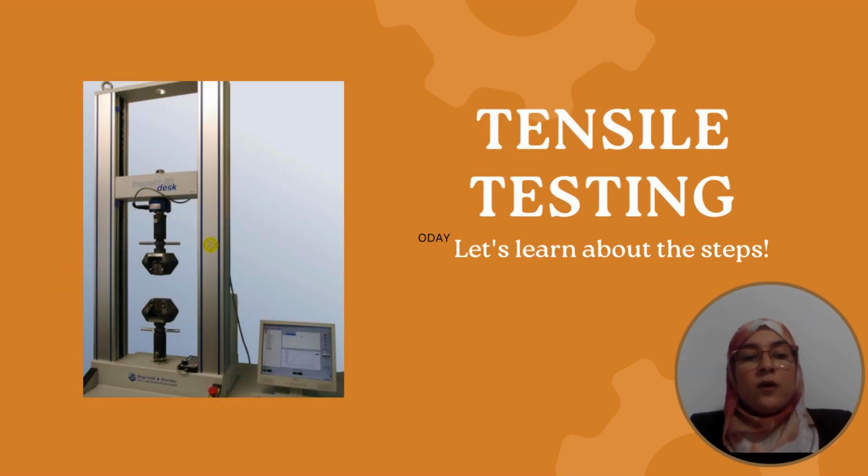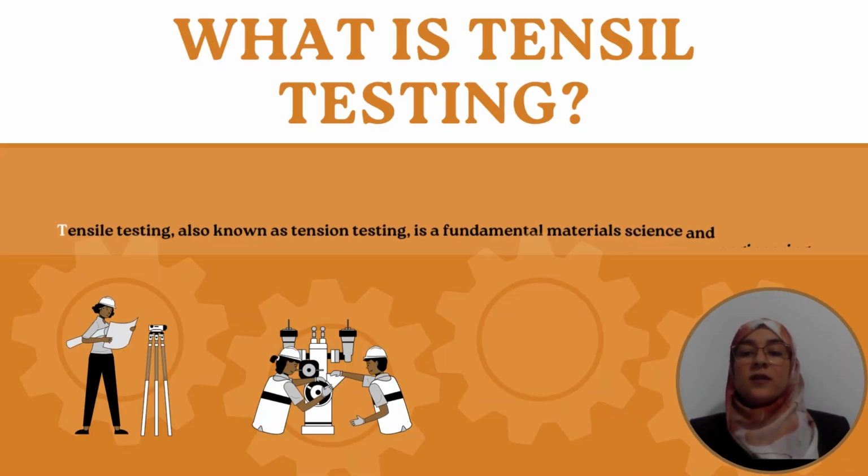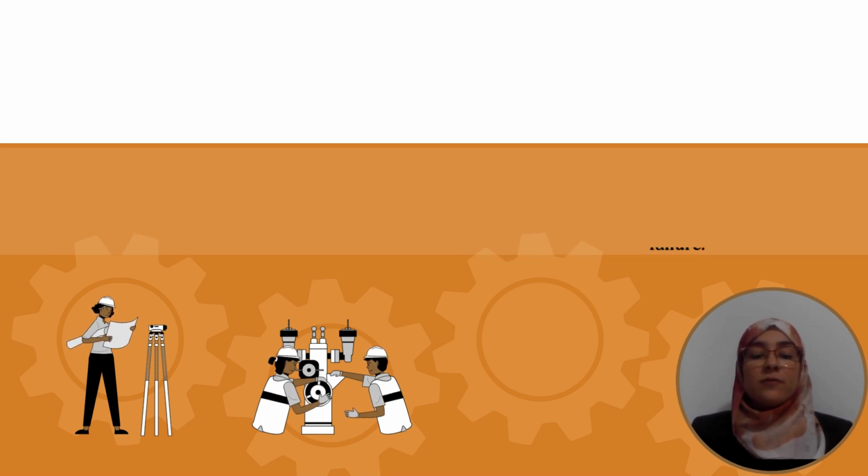In this video, I will explain one of the methods of material mechanical characterization, which is tensile testing. So, what is tensile testing? Tensile testing, also known as tension testing, is a fundamental materials science and engineering test in which a sample is subjected to a controlled tension until failure.